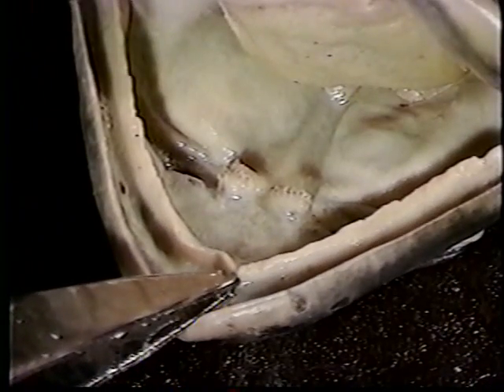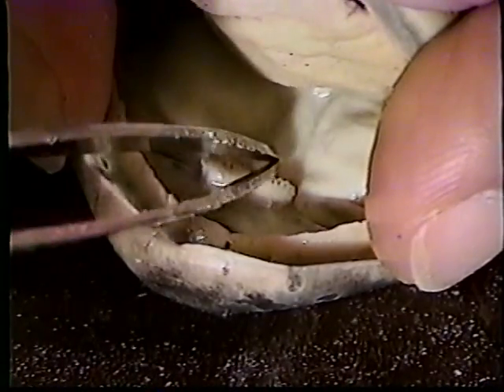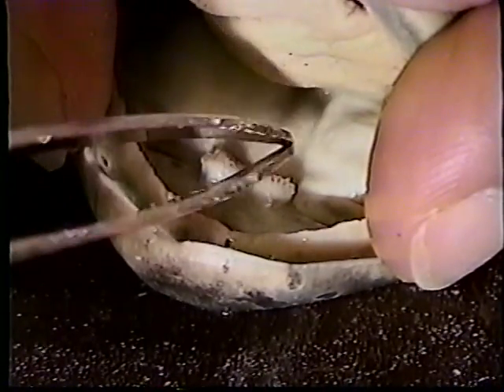Any teeth found in the frog's mouth are used to secure or hold its prey, not to attack or catch it. The two largest teeth are found on the roof of our specimen's mouth. We have now completed the external examination of our frog, and we're ready to begin the internal examination part of our dissection.